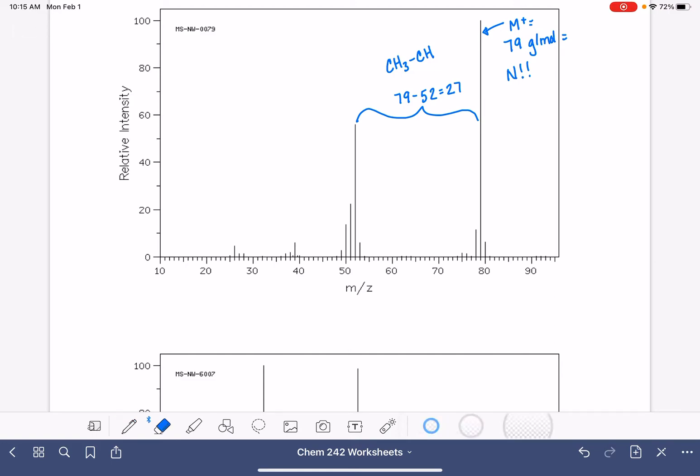Or CH3C, that's maybe something like this, or maybe it could be a CH2CH, something like that. It's kind of hard to tell what exactly that corresponds to.